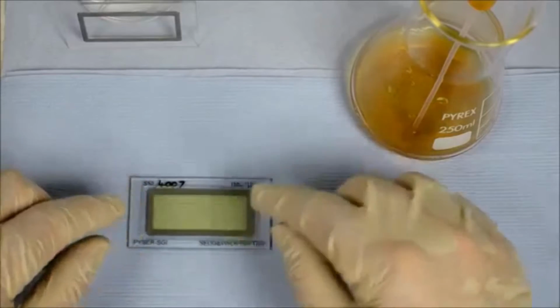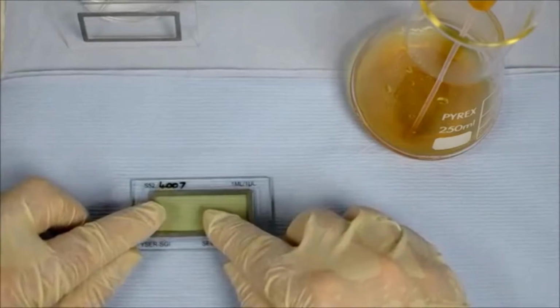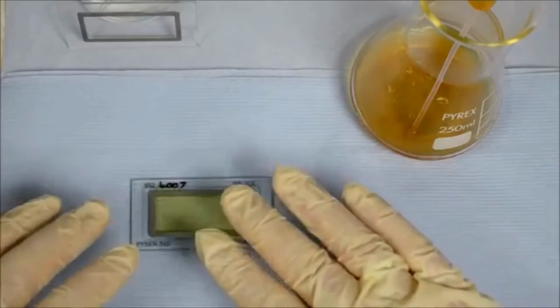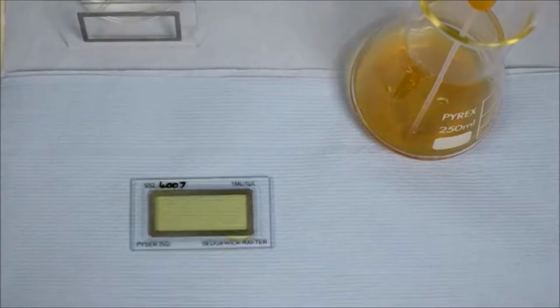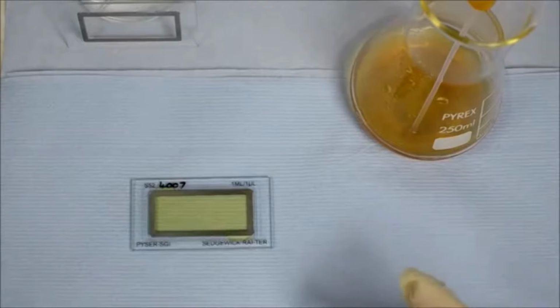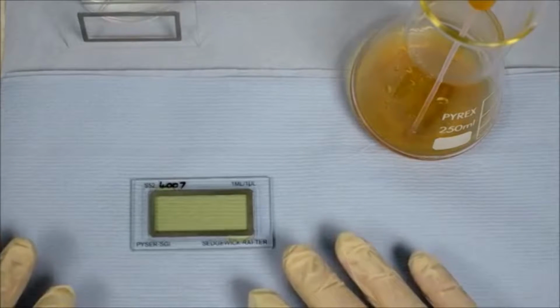Now, you must be careful you don't overfill, because you don't want the cover slip to float free. In fact, you like surface tension to hold it close down onto the cell wall itself. Now, before we can make a cell count with the Sedgewick Rafter, we need to leave it to settle for 15 minutes to allow all the algae and other particles to settle to the bottom of the chamber.